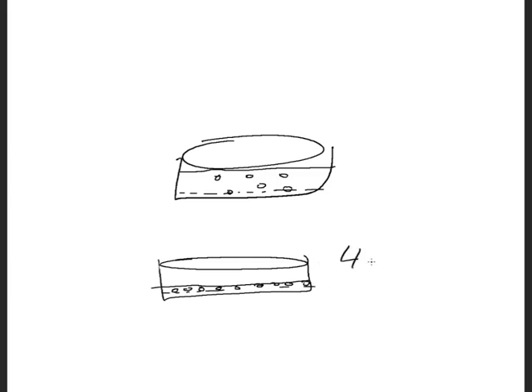Normally the transfection lasts a minimum of 4 hours, up to 24 hours. Obviously, you've got to do it at least that long for it to work, but up to that long. The problem with going this long, for 24 hours, is it can dry out and it can cause problems. It depends whether you have a rocker or not in doing that process. So those are the variables that I would want you to talk about when you're doing your write-up, in terms of some of the problems that can exist with the transformation protocol.